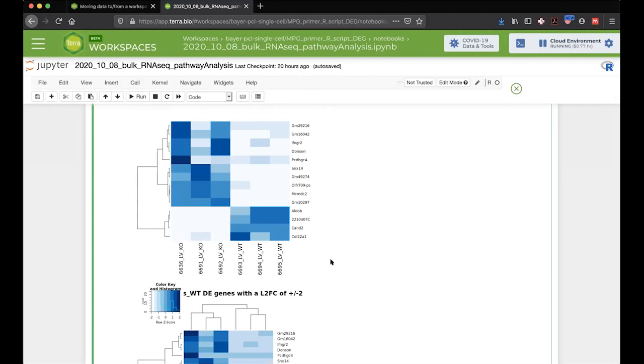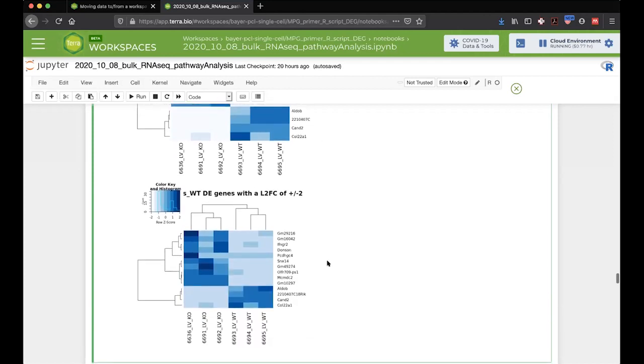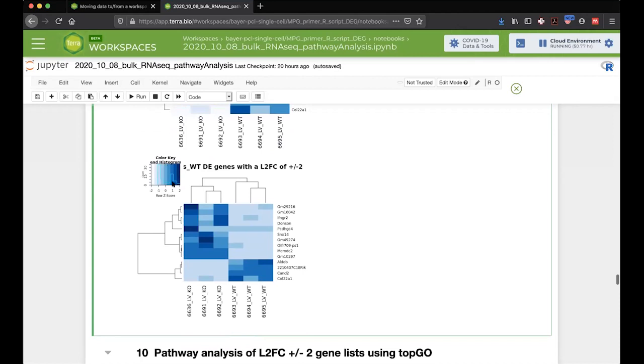It's almost always quite a bit more genes, and you typically can't even read the names. But this example is really nice because of that. And I really like the density plot here because I struggle with having a good legend. And I really like the legend density plot that heatmap.2 produces, especially for preparing figures for publication. So this is my method.